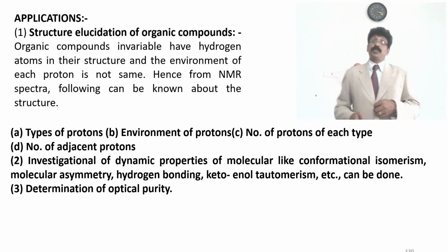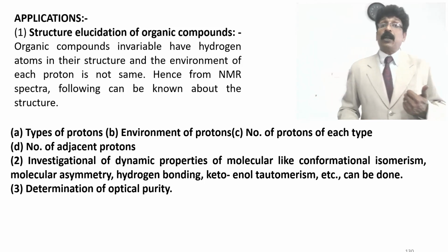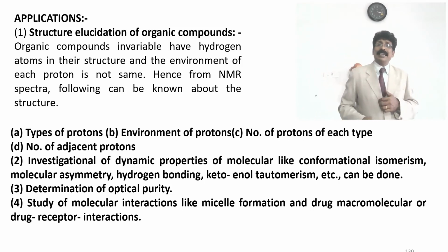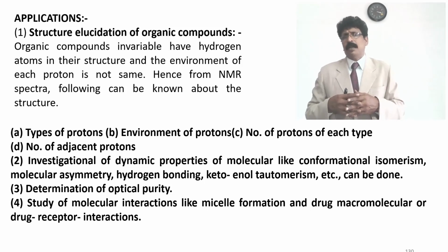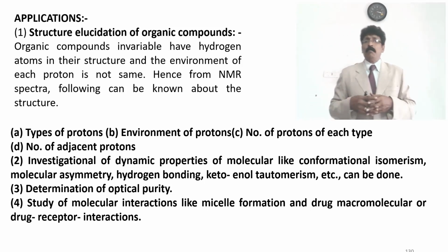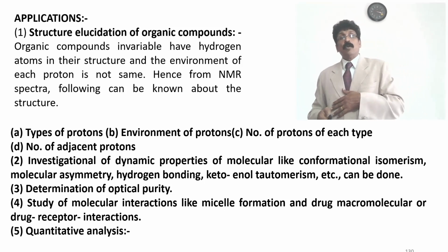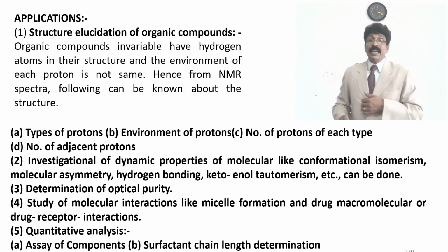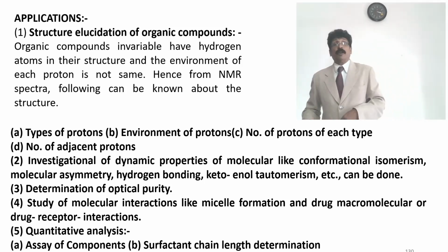What is the position, how many hydrogens are present, what type of hydrogen is present, and in what form it is present can also be determined. Determination of optical purity is also possible. Study of molecular interactions like micelle formation, micelle network formation, which is more useful for formulation systems. Micelle formation and drug macromolecular structures or drug receptor interactions can also be studied. Quantitative analysis also can be done. Assay of components and surfactant chain length determination in surfactants, which you use in various liquid oral preparations in formulation, can also be studied by NMR.